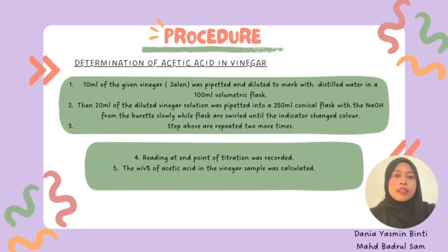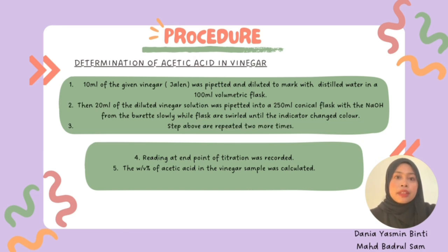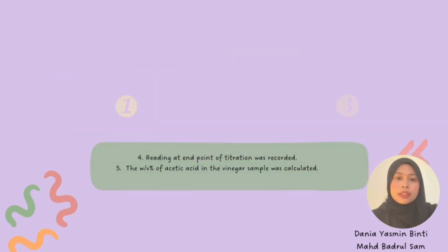For the determination of acetic acid in vinegar: 10 mL of vinegar was pipetted and diluted to the mark with distilled water in a 100 mL volumetric flask. Then 20 mL of the diluted vinegar solution was pipetted into a 250 mL conical flask and titrated with sodium hydroxide from the burette, slowly swirling until the indicator color changed. This step was repeated two more times, and the endpoint readings were recorded.